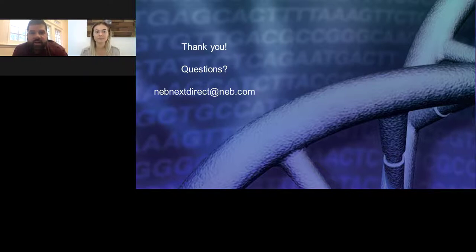That's a great question. This presentation was focused on human health and how target enrichment applies there. But target enrichment is being employed across industries, from plant genotyping, crop development, and food testing, to understanding different breeding strategies for different organisms and cattle. So there are lots of different applications for which target enrichment is being applied, and some will have different requirements based on the needs of a specific application. But it's as much as the imagination can take it, in terms of fundamentally needing to look at the genome of an organism and look at regions of it in greater detail than you would by just doing whole genome sequencing.